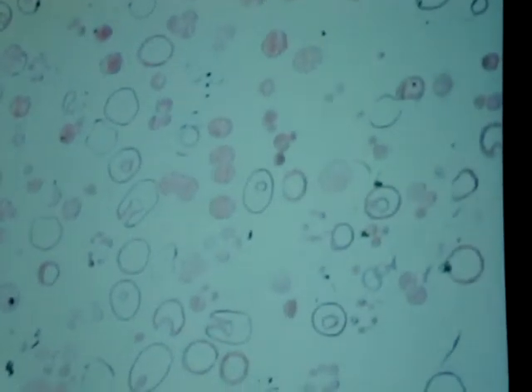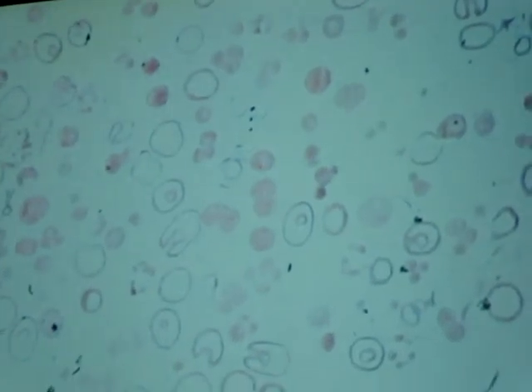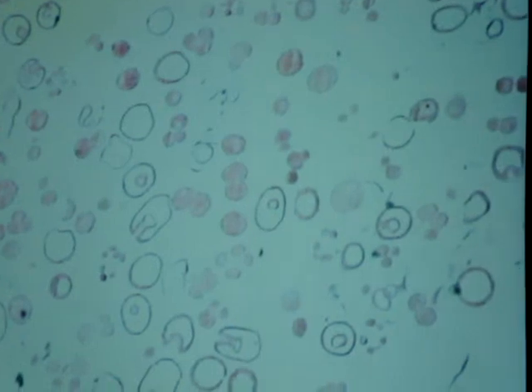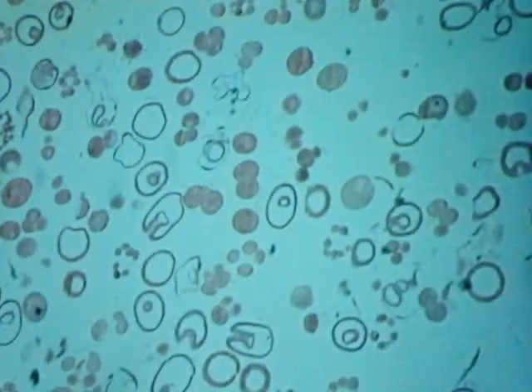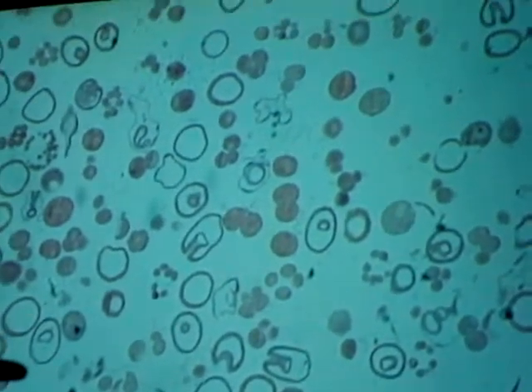If you have that Rust book, which is the one with the skull on it, that you can also use for the cat, it has very good pictures of these slides in there. It will go through late blastula, early blastula. You don't have to know the early and late. We're just going to go for the main developmental stage in there. All right, so let's see if we can get them all on this one.